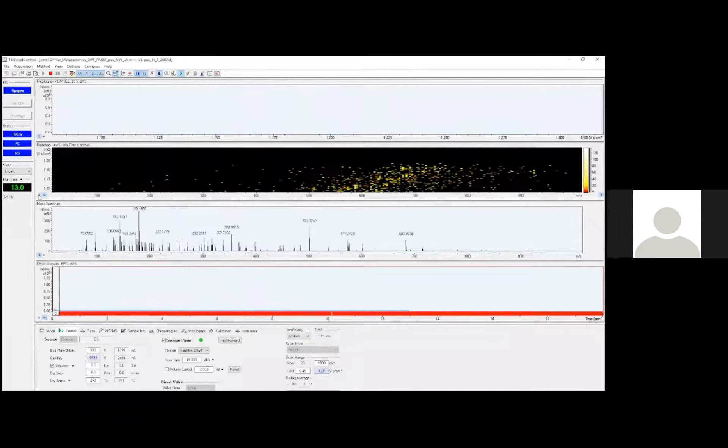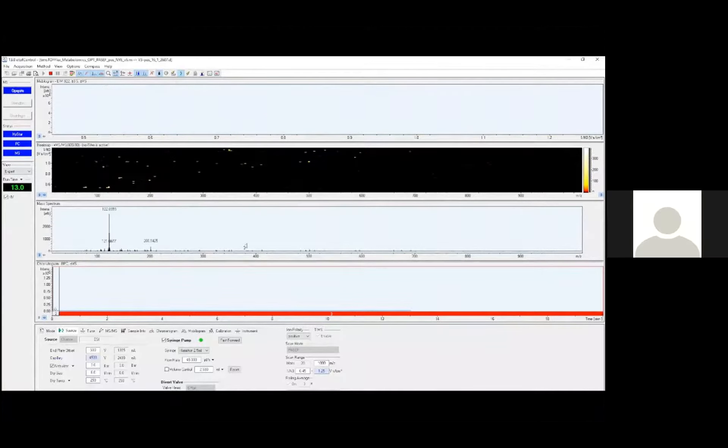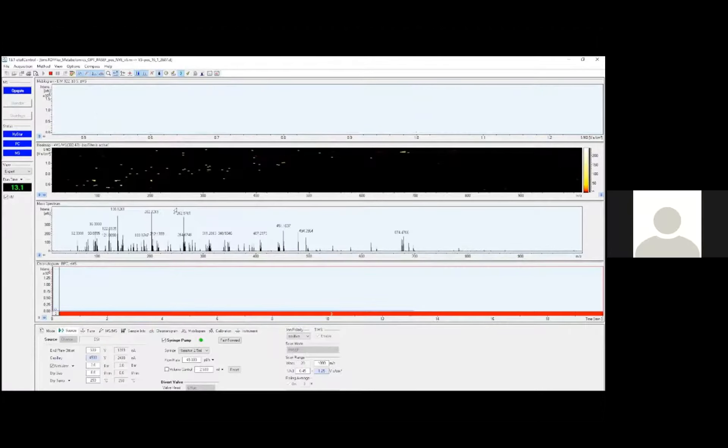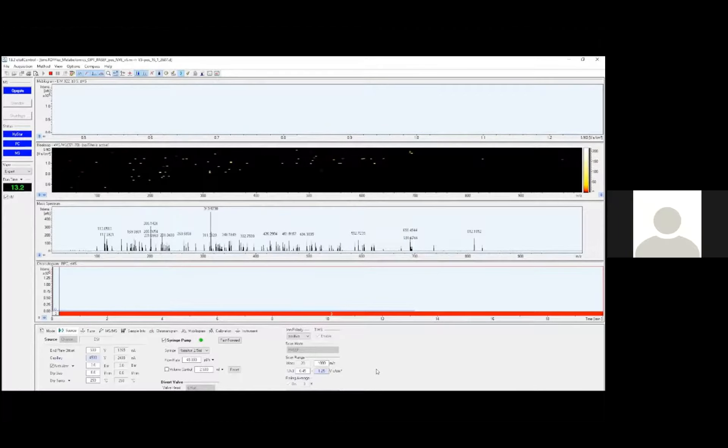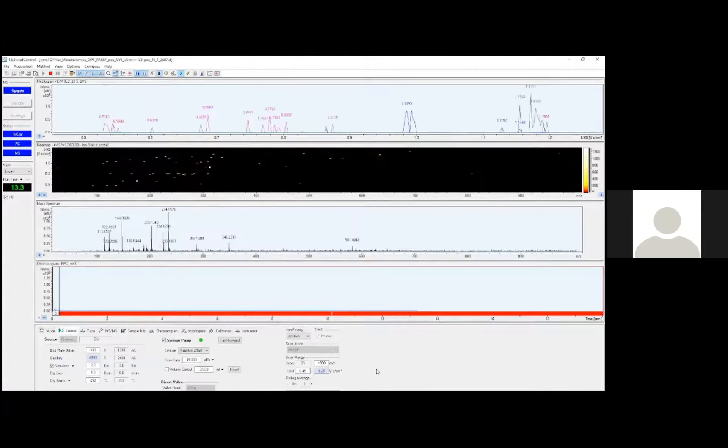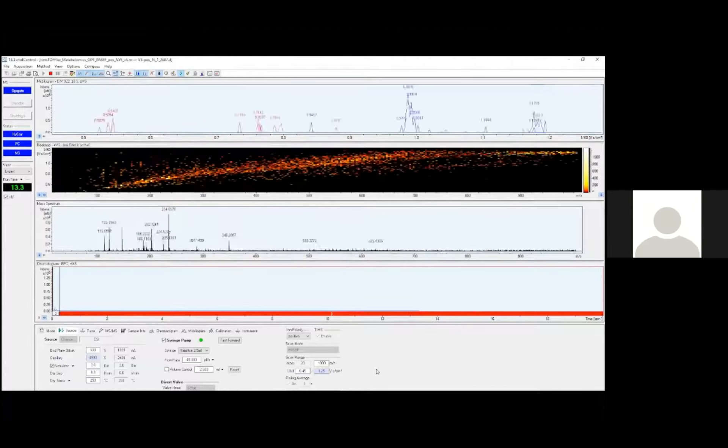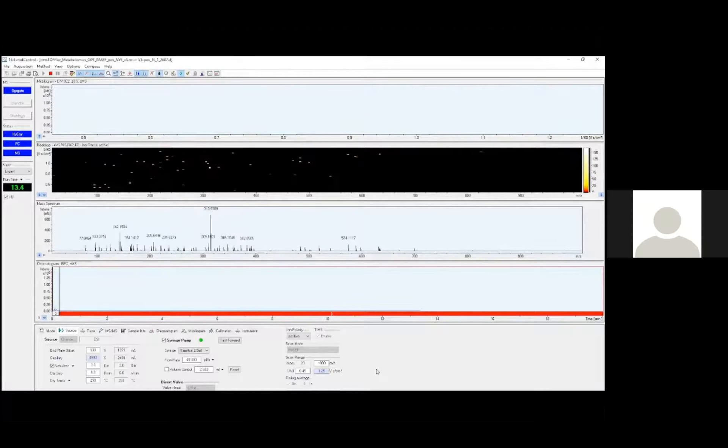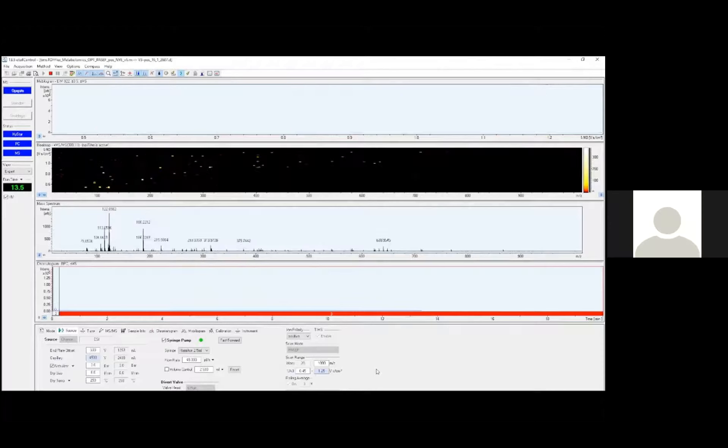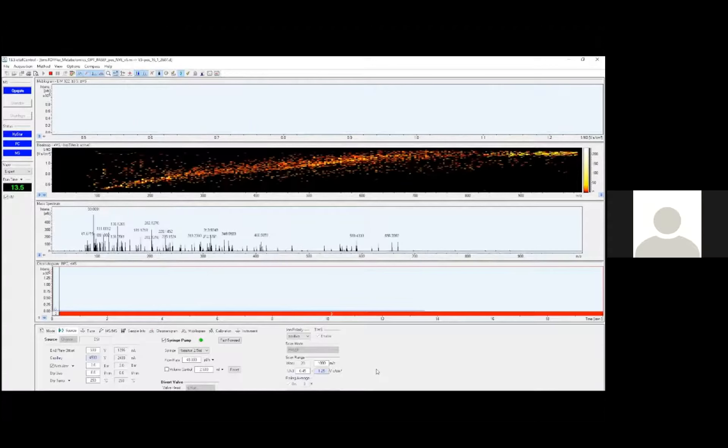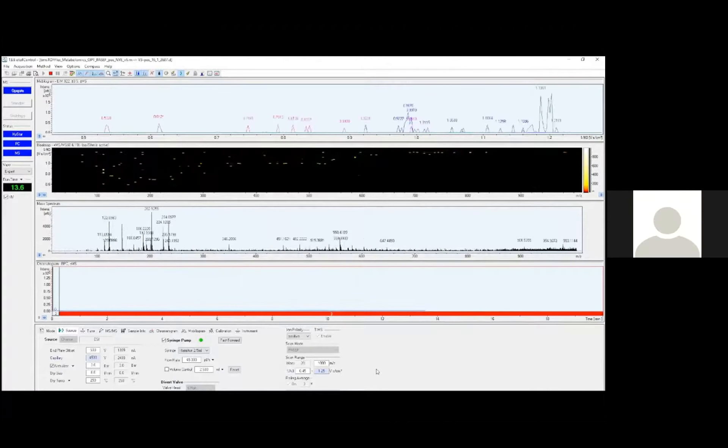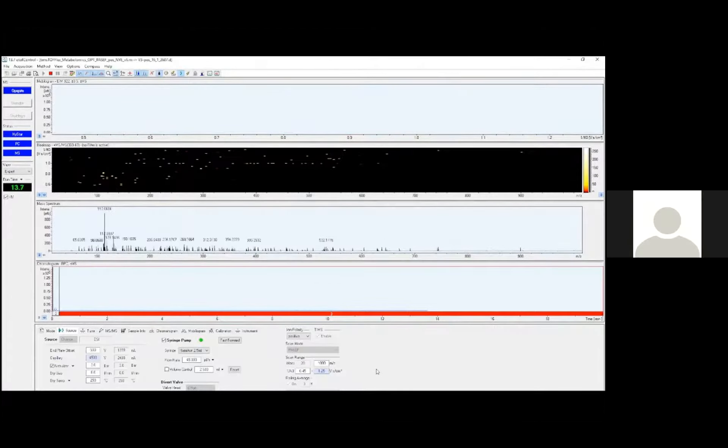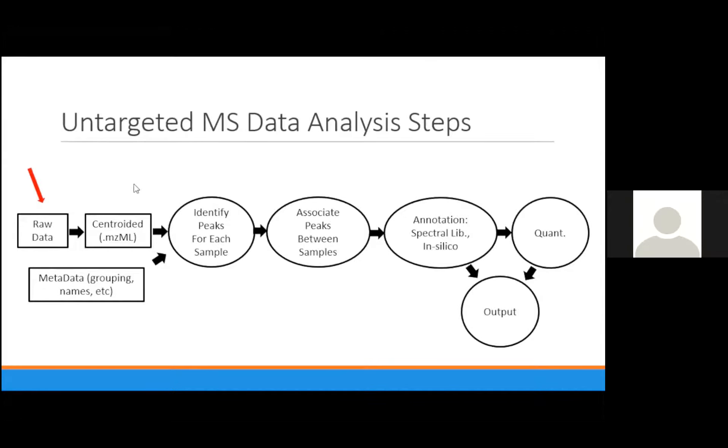This is a view of the OTOF control software during acquisition. You can see the mobilogram on top, the heat map in the middle, and that shows the mobility on the y-axis with M over Z on the x-axis, and intensity is done by the colors. And then beneath that is the spectra, and beneath that is the chromatogram. The reason the mobilogram, heat map, and spectra flash, like you can see, is that they're in the PASEF cycle. I don't really have time to go into what PASEF does, but it's an ion accumulation and fragmentation cycle, and that's actually what generates our MSMS data.